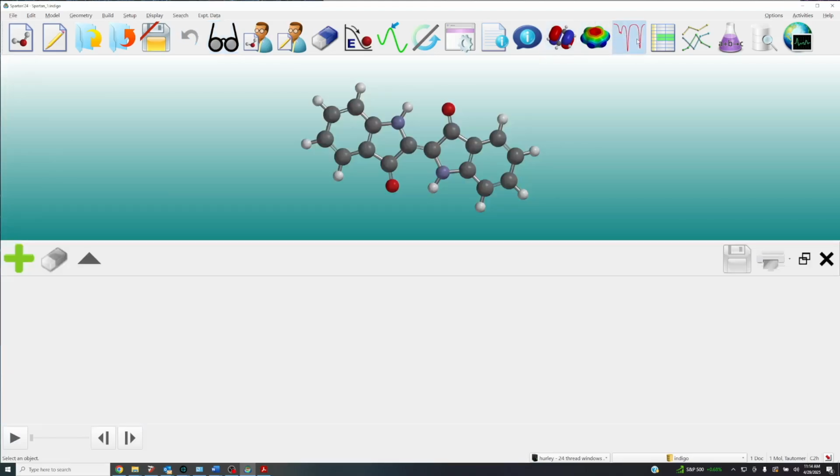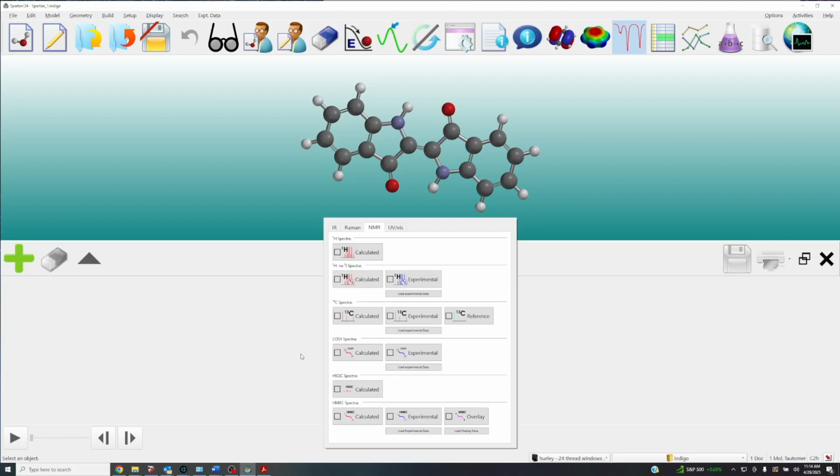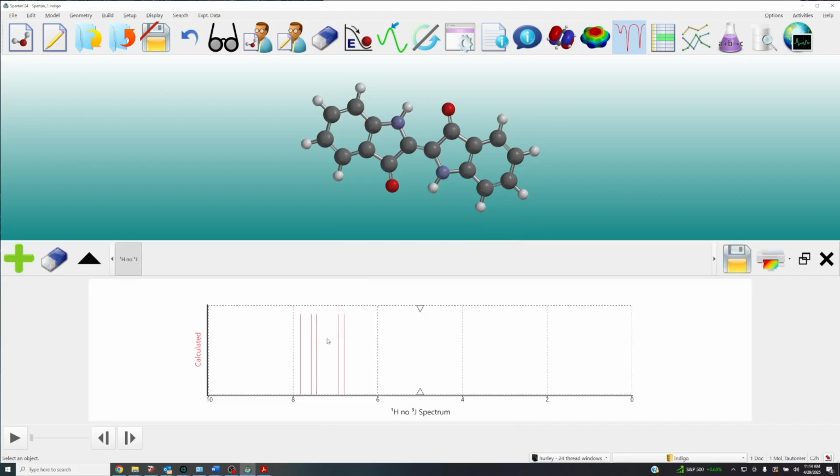So the display menu Spectra, or this little Spectra icon, and we will add. Let's first add not the top proton, but underneath that there's a proton with no coupling. So basically where couplings are set to 0. So let's click on that first. Kind of a simplified display. Okay, so these will show the sort of unique protons, and there are 5 in this case.